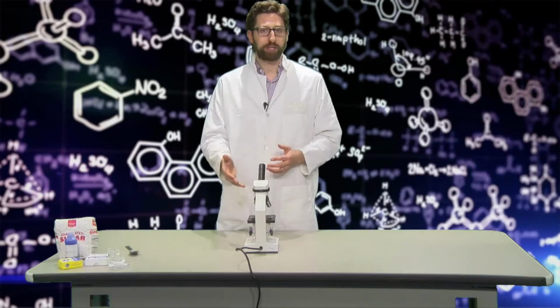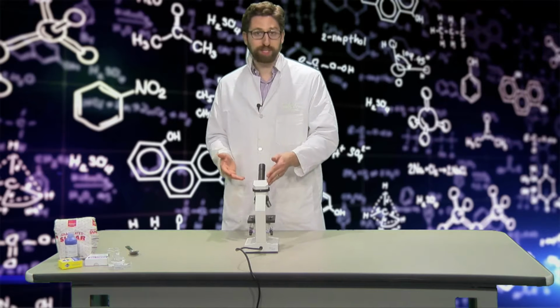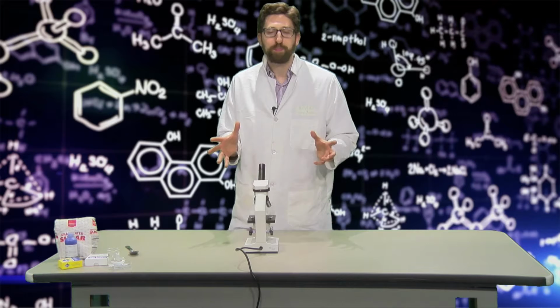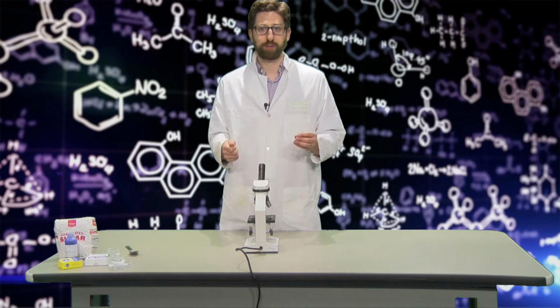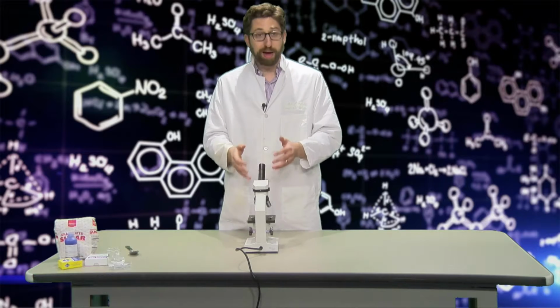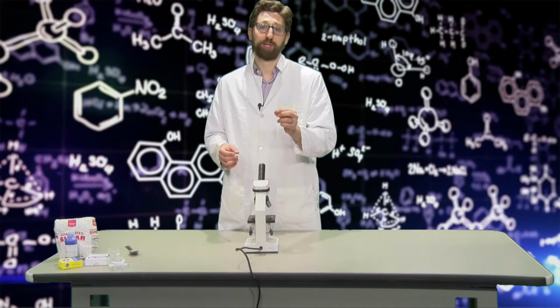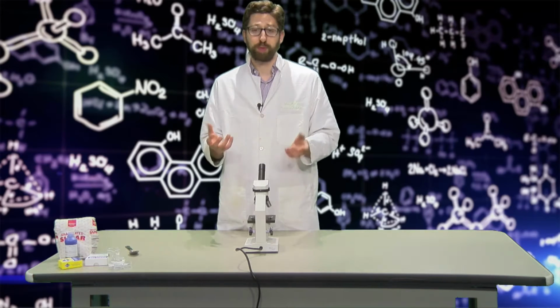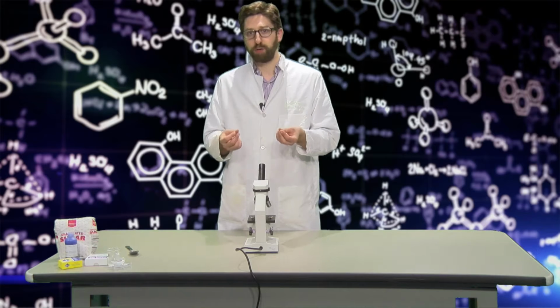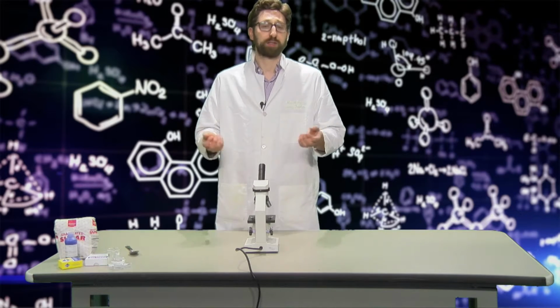But these machines are actually pretty complicated, for a good reason. Microscopes allow us to magnify objects. To magnify means to make larger. Think about what a magnifying glass does. You can use it to make objects seem bigger to your eye. A microscope takes tiny, tiny objects, microscopic objects, and makes them seem much larger. Micro, that prefix, means tiny. Scope is something you can look through, so a microscope lets you look through it and see tiny things.